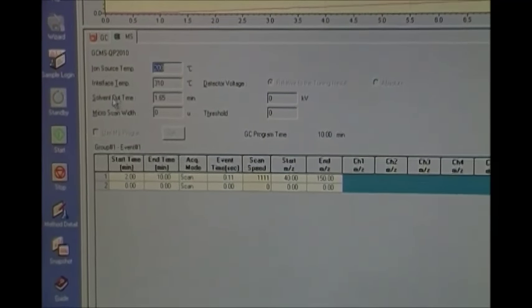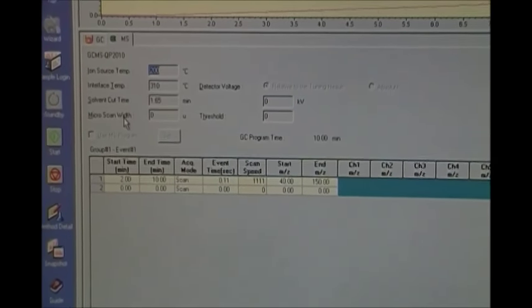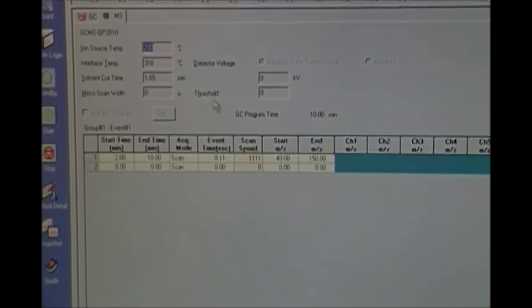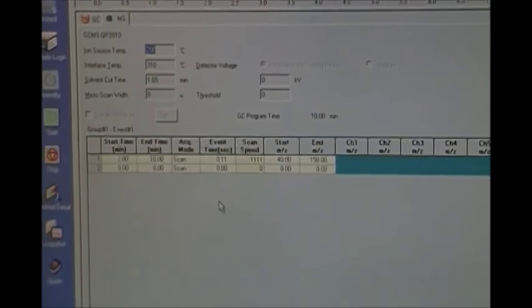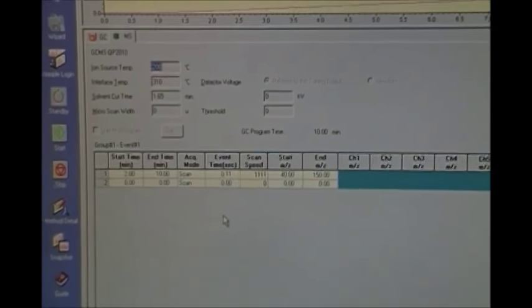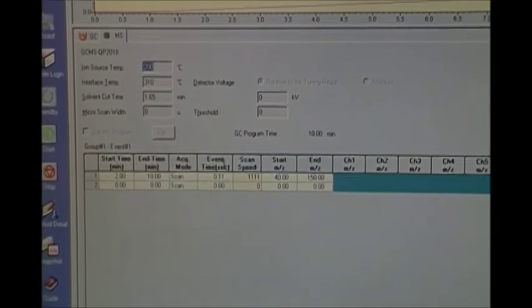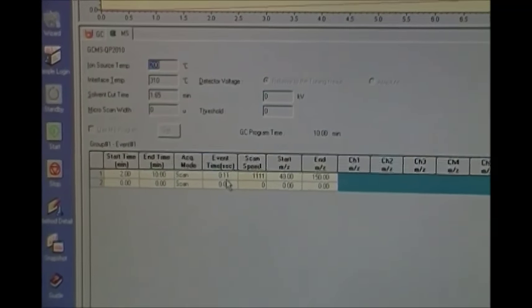So other than the cut time, we have our event time, which is right here. Our event time is essentially how often the mass spec is scanning the sample. So we're going to run a new scan every 0.11 second.